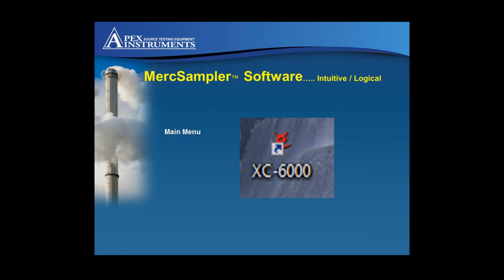Your IT department would assign you an IP for the instrument. We would put it in the instrument for you, verify that it can communicate at the rear of the instrument, and then your contractor would typically bring up your fiber and your media converter, and we would provide that connection to it. And then downstairs, you could always install the software on a server and also access the instrument.